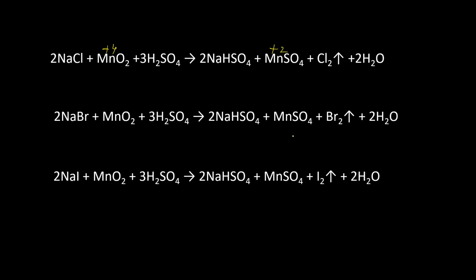Okay. And here when you are holding the moist paper dipped in starch solution, it becomes yellow in color. That means the bromine, it is moist paper, no? So it is getting dissolved in that water and forming a complex with the starch, which is yellow in color. Similarly, iodine also with the moist starch paper forms the blue color complex with the starch.